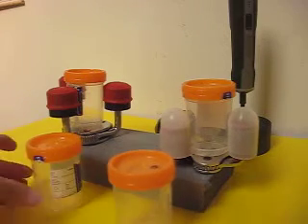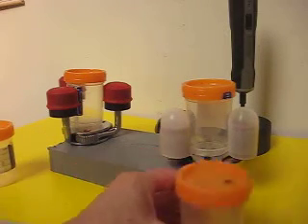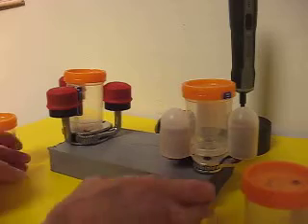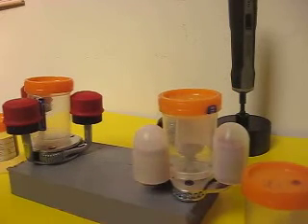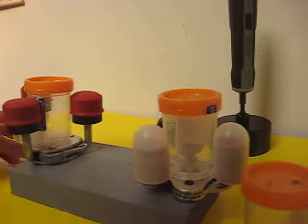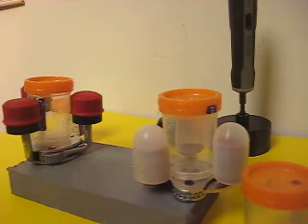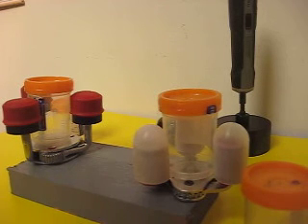So we have come up with a solution which is immobilizing racks. This rack has unique features which is you don't have to hold on the bottom anymore.